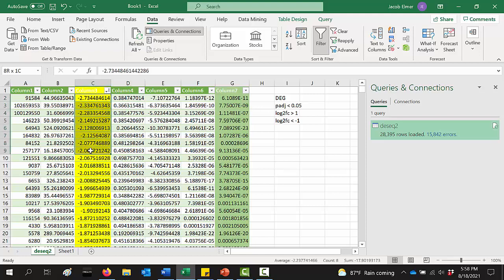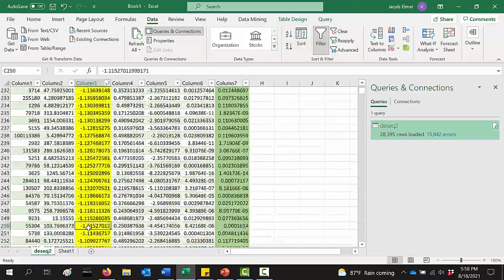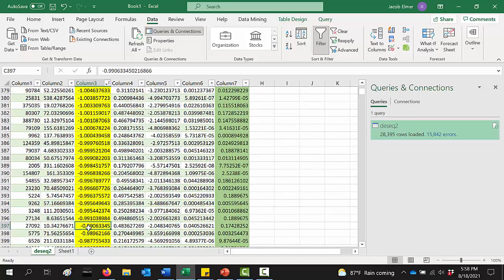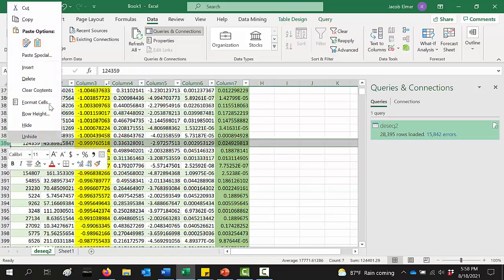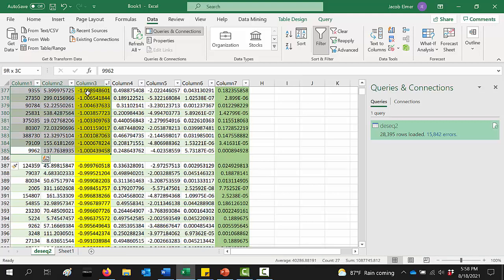Is here now, we're looking at these genes that are significantly downregulated because that log 2-fold change is negative. And again, I can scroll down here to where we have that -1 threshold. Here we go. I can insert a line there. And now I can say about these genes, these 385 genes that are up from that row, they were significantly downregulated. Okay?